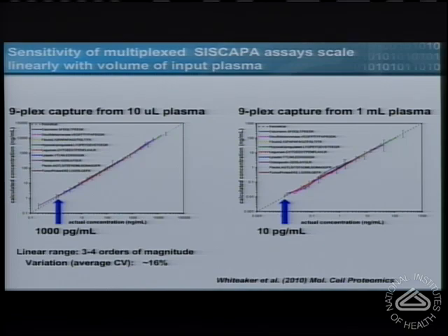For those of you who are not in this area, there are relatively few qualified immunoassays available that hit that kind of sensitivity limit. It's generally more in the 50 to 100 picogram per mil range where one finds this. So think about this as a drafting tool for assays that can give us this kind of sensitivity if we need it.